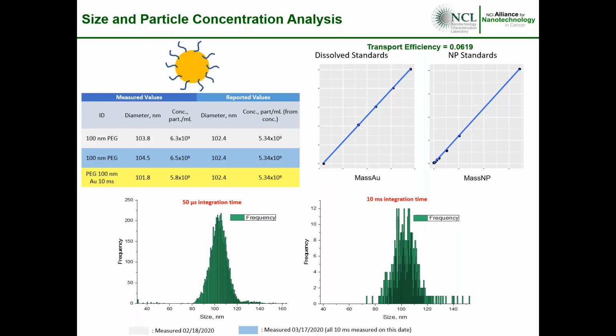And so before we can actually start comparing these instruments with each other, we have to understand our solution that we're going to be using for this. What we have here is our pegylated gold nanoparticles, and we looked at these using single particle counting ICP-MS, and we did this three times basically.